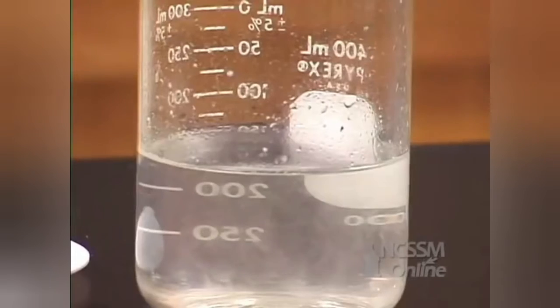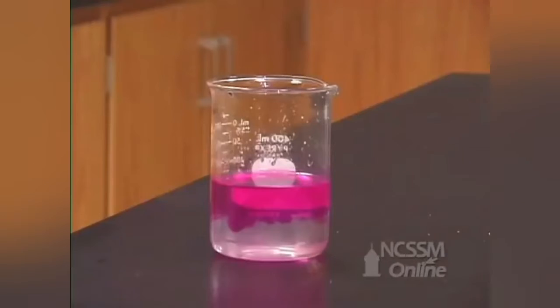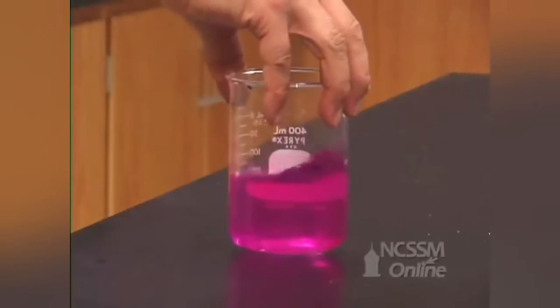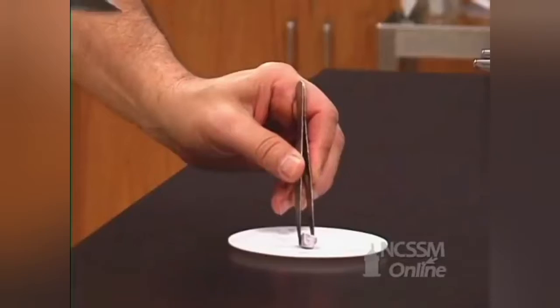The reaction is very exothermic and the hydrogen that is produced ignites. We can test for the formation of potassium hydroxide by adding phenolphthalein. The solution turns red-purple due to the formation of potassium hydroxide.